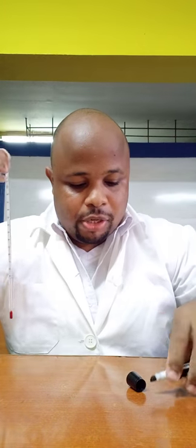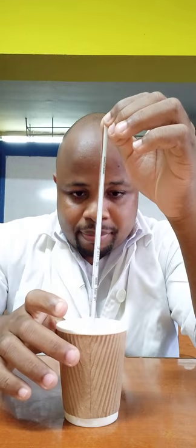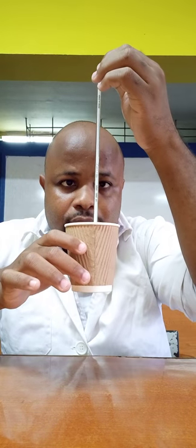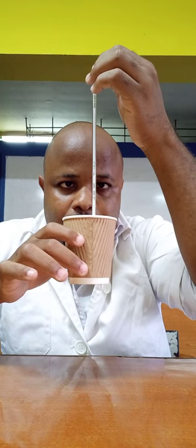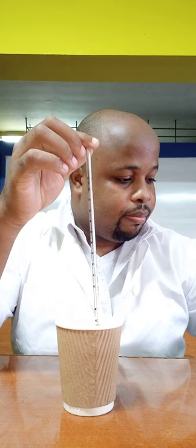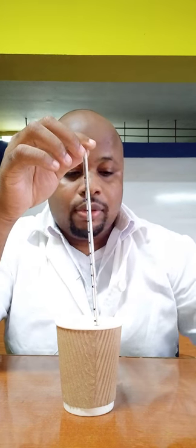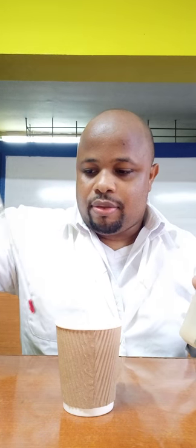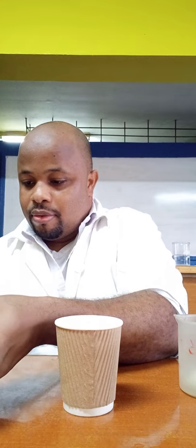Now I'm going to move on to the next experiment with sodium hydroxide — it tends to stick to the container so I'll move quickly. First I'm going to measure the temperature of the water again. This one is 27 degrees Celsius. So the temperature of this water is 27 degrees Celsius. I'm going to pour the sodium hydroxide inside and quickly record the temperature.